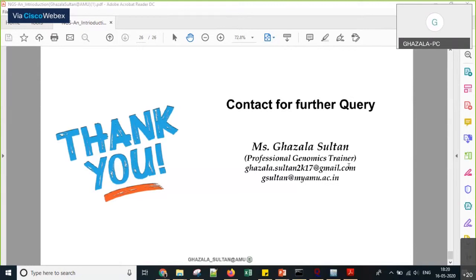Let me take the question from the chat box itself. What is the role of NGS for students who are doing a final year bachelor project? That depends on which section of NGS they are doing, either the sequencing section or the analysis part, because most of the time we are doing analysis. Next, many students are misguided while doing projects. I don't know what kind of misguidance this is. If you can tell me later what exactly the issue is, I can answer based on that. And yes, for students, NGS means they can start from the first step, that is sample preparation, to data analysis and then result interpretation.